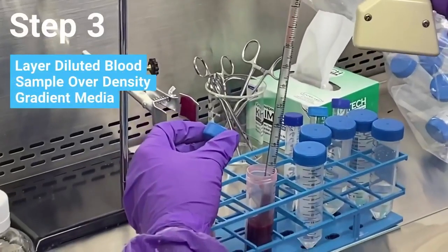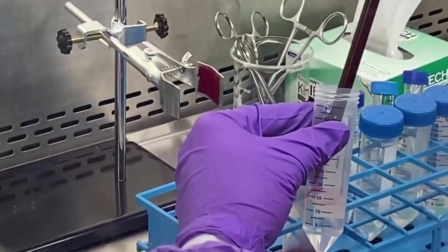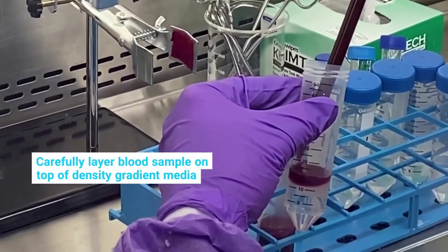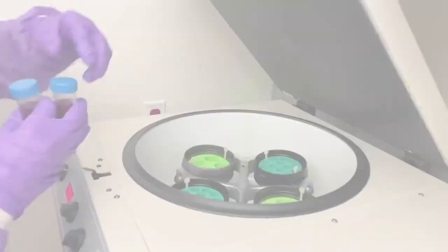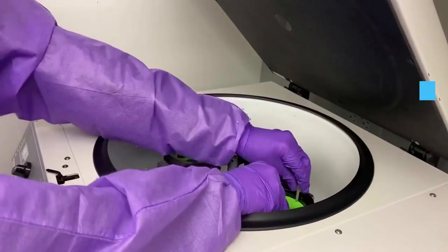Next, carefully layer the diluted blood over an appropriate volume of density gradient media in a conical tube. Place the sample in a centrifuge, ensuring it is properly balanced, and spin per the gradient media manufacturer's recommendations.